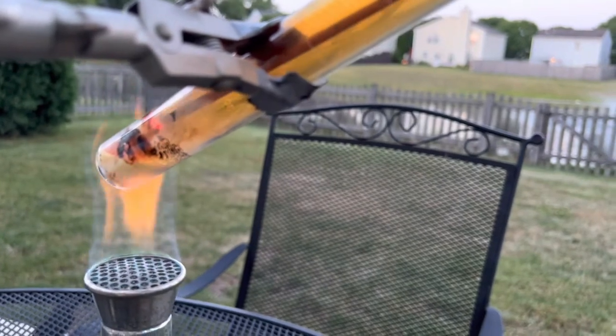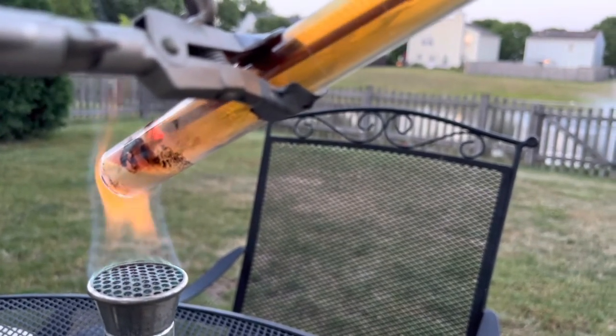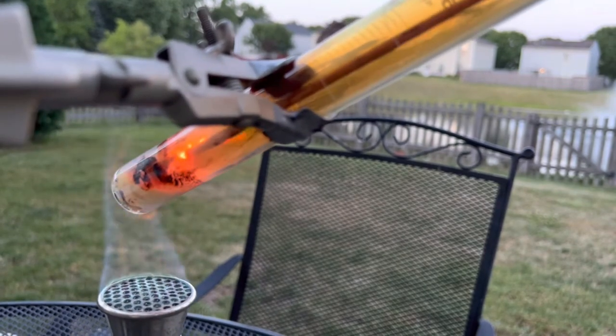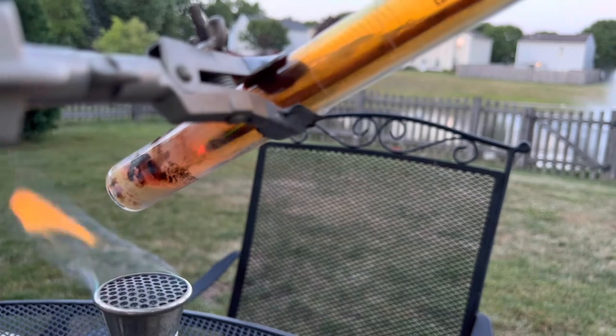Yep, a little bit. It's glowing in there. There it goes. There it is. Definitely oxygen inside the test tube being released in this reaction.